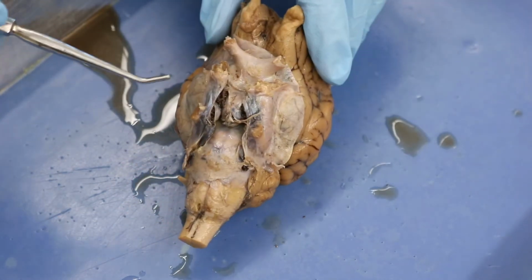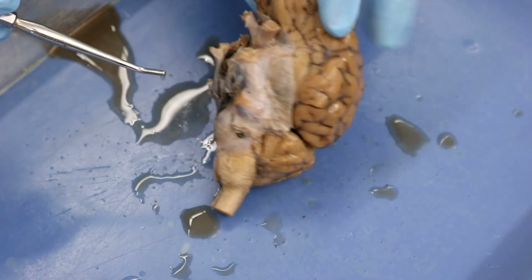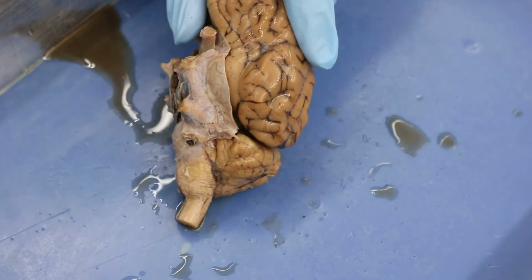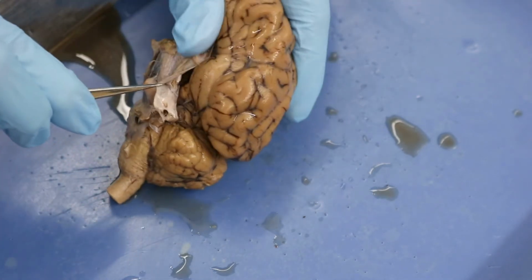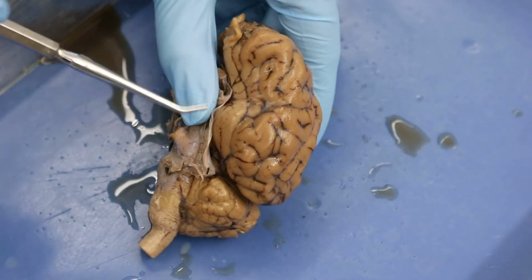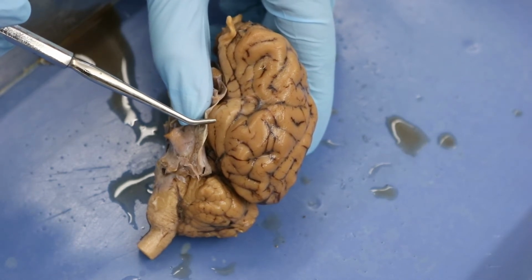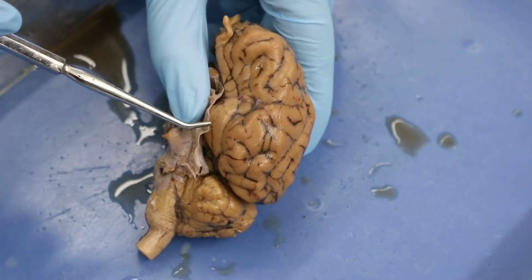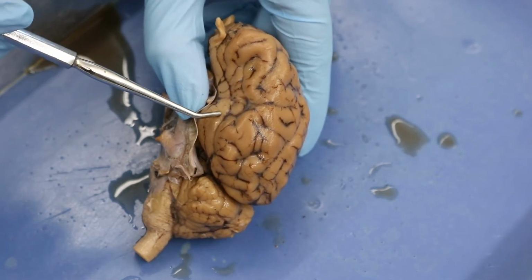So, let me see. Can we get anything else? We got all those. Let me pull this back a little bit. All right, I'm going to get my tweezers, and I'm going to pull this back. And when it's pulled back, we can see that we have another lobe right here, okay? And this is the piriform lobe. The piriform lobe is present in sheep. It is not present in humans, but that is what we're seeing here.